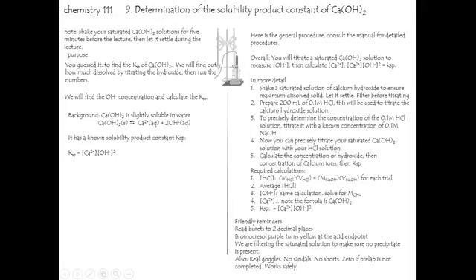Before the lecture begins, remind me to have you shake your saturated calcium hydroxide solution for 5 minutes before the lecture, then let it settle during the lecture. We'll be measuring how much of that calcium hydroxide's dissolved, so let's make sure we give it a good chance to all settle there, and then we will begin the lecture.